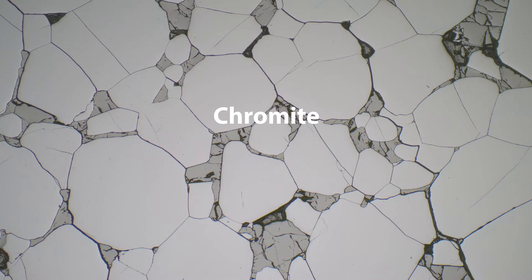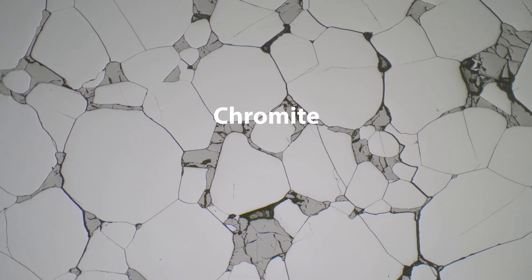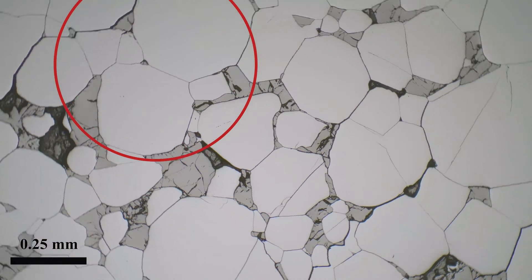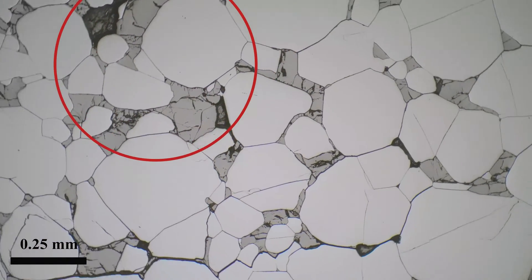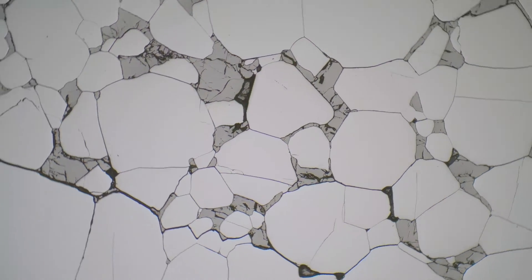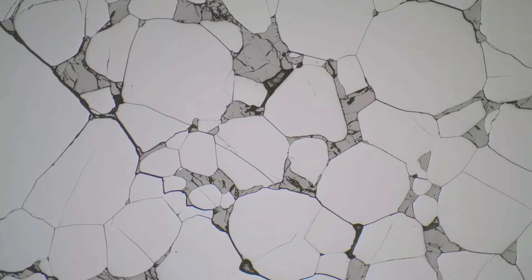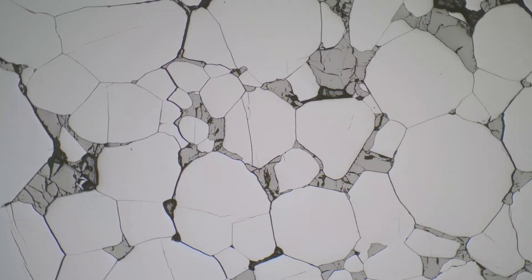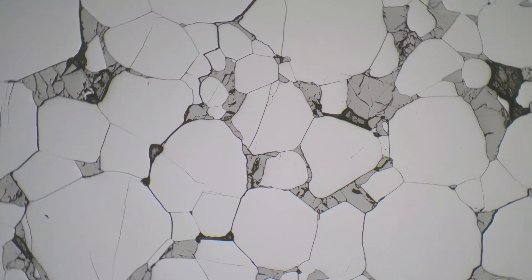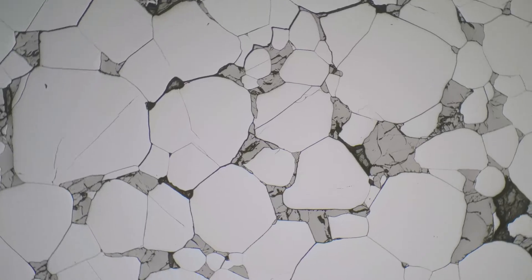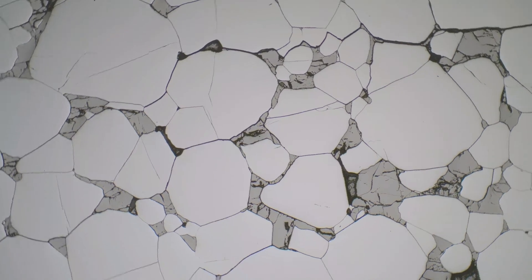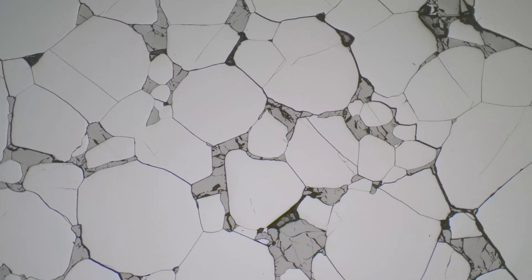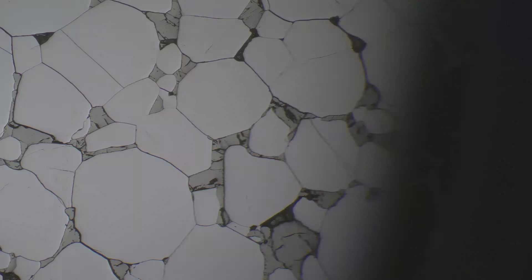Today we're looking at the mineral chromite. This is found in a lot of magmatic systems and it's the light gray mineral that we see in this slide. It's a cubic mineral and as you can see, as I spin the slide, it's not changing in color, so it's non-pleochroic.